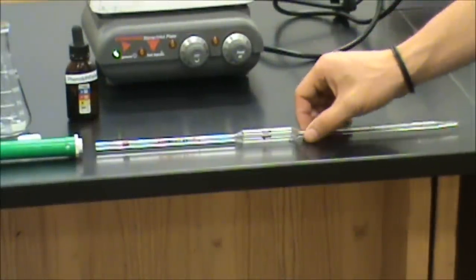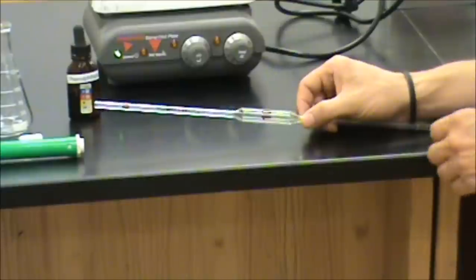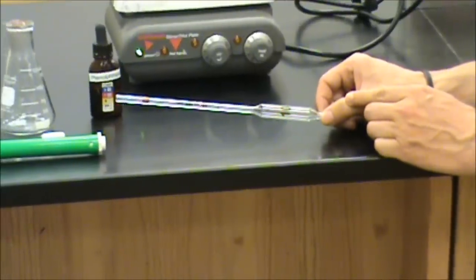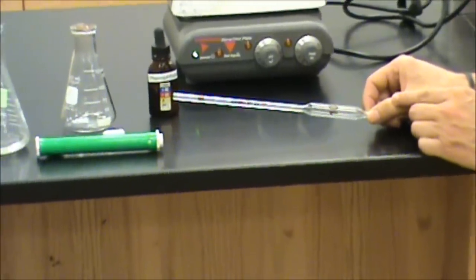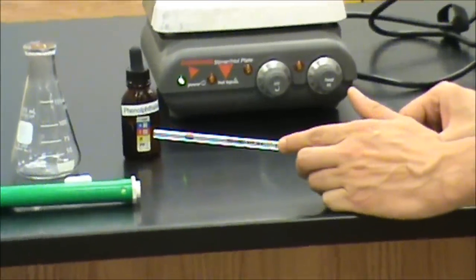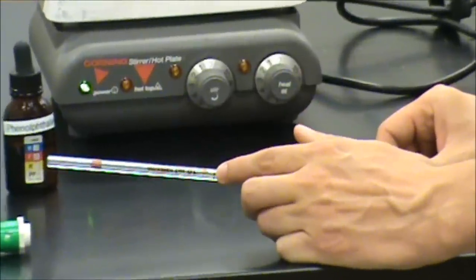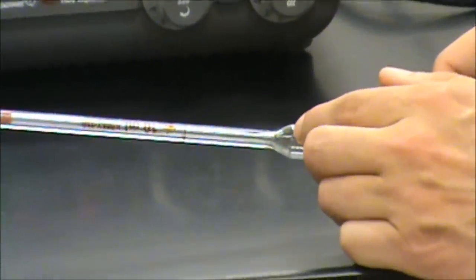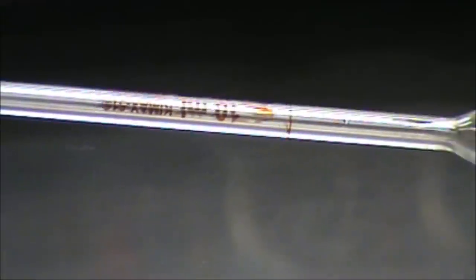This is our 10 milliliter volumetric pipette. In order to accurately measure out 10 milliliters, we want to get the bottom of the meniscus lined up with this marking on the glassware that's just above the wide portion of the pipette.